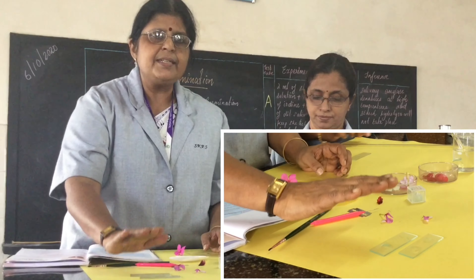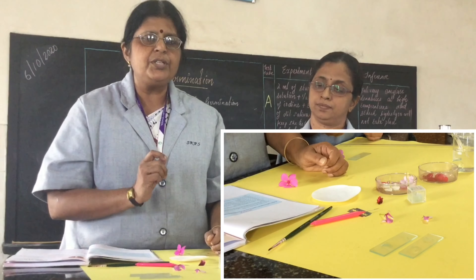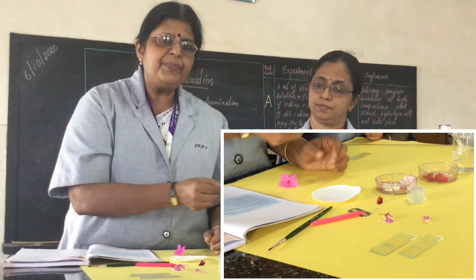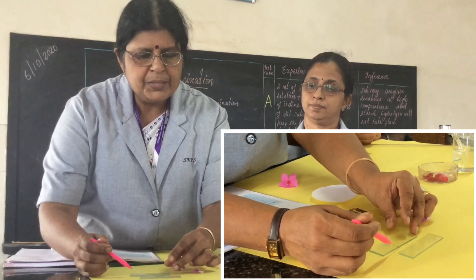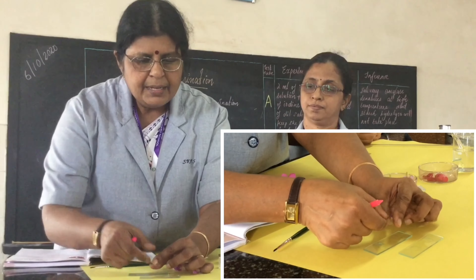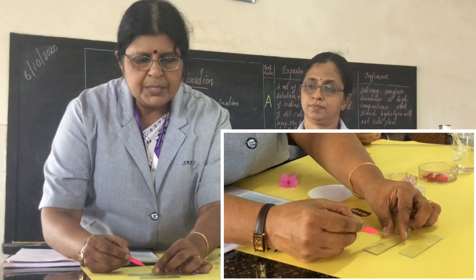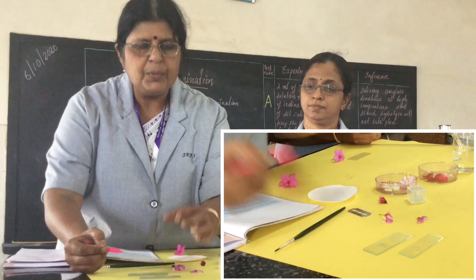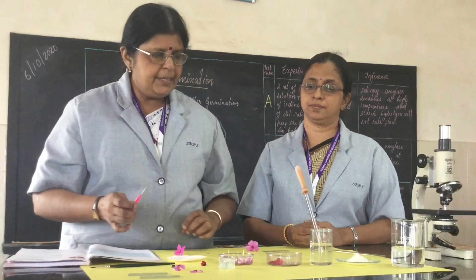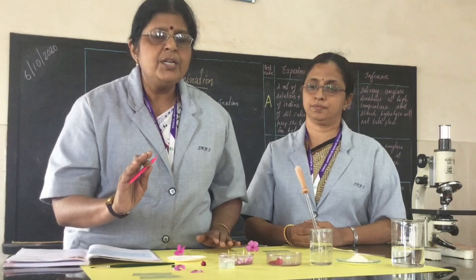Then keep the slide aside for 10 to 20 minutes so that the pollen tube has time to come out. At that time, take a cover slip using a needle and gently place the cover slip over the cavity. You have now prepared the slide and keep it aside for 20 minutes.